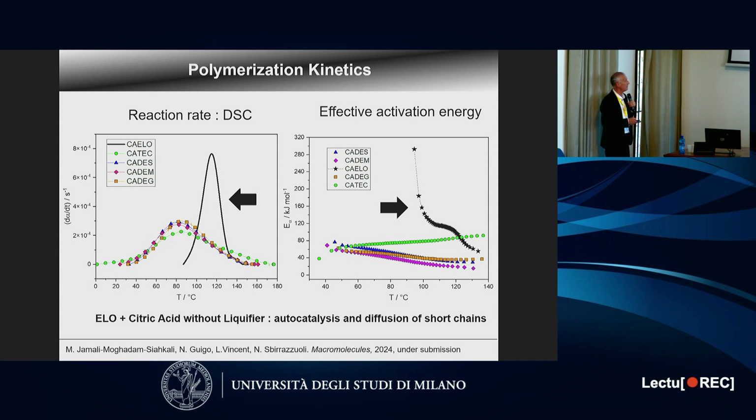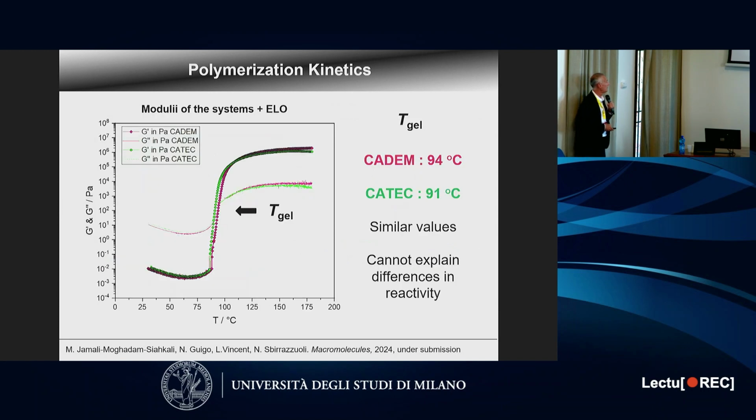Now, if we look at the activation energy dependency, we see that it is very different without a liquefier. We have a strong decrease of activation energy at the beginning that corresponds to autocatalysis, and we have shown that the low value at the end generally corresponds to a control by diffusion of short polymer segments.